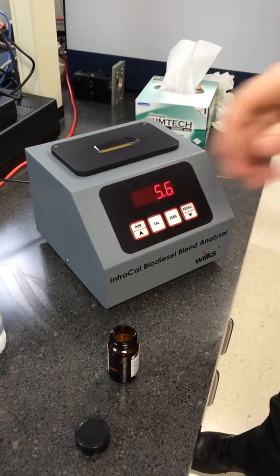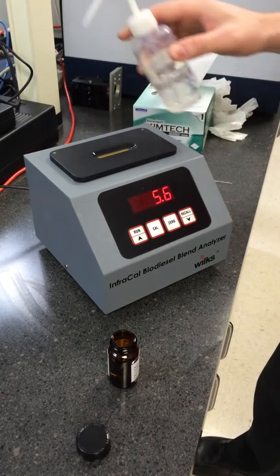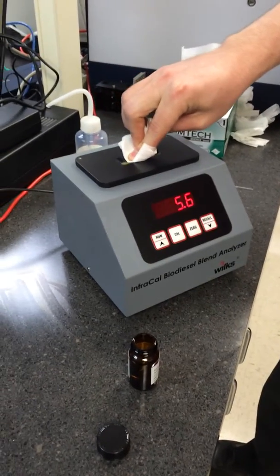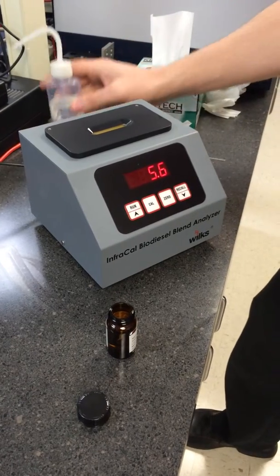To do so, take your solvent, typically hexane, and apply it to the crystal. Then you'll want to wipe off the solvent in one direction. Repeat this one more time.